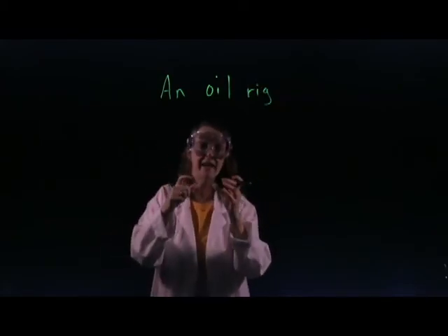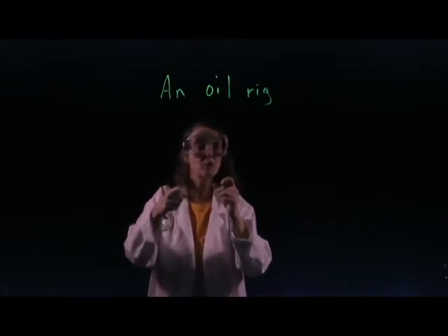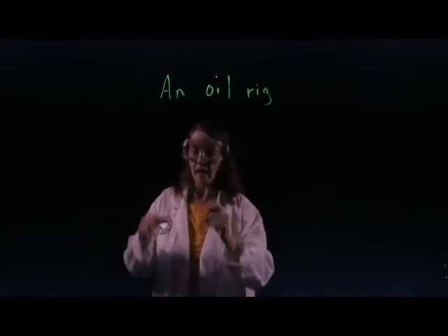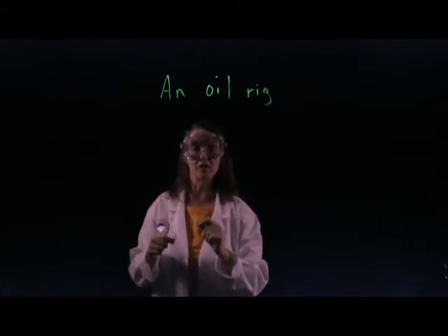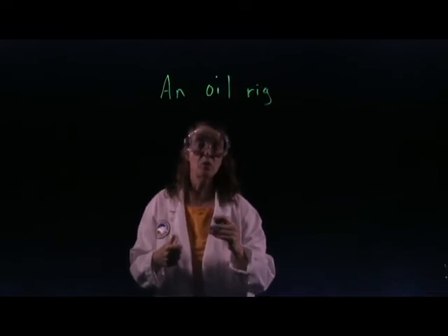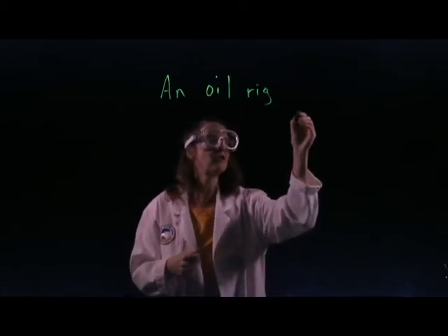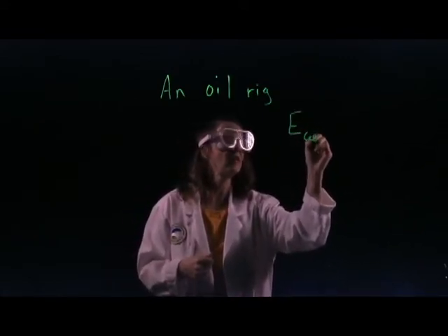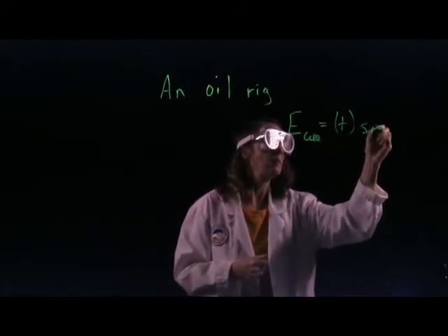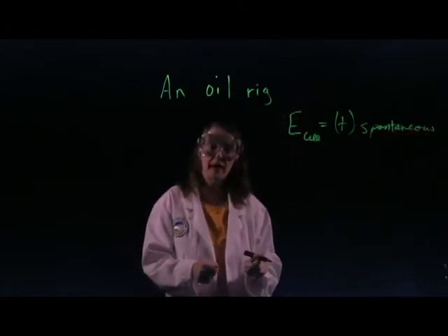So what we're going to do today is look at the electrochemistry reactions between different metals. You're going to have a collection of different metals at the front of the lab, and we're going to measure the voltage difference between them. Voltage is a potential energy difference between the site of oxidation and the site of reduction. And we're going to be measuring the voltage in terms of an E cell, right? And a positive value for an E cell means a spontaneous reaction. That just means that it occurs once you hook them together.